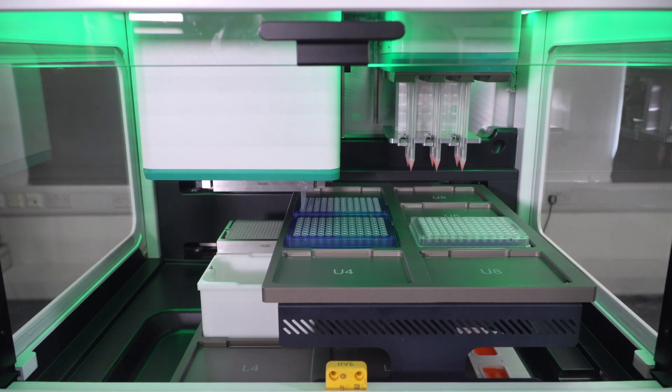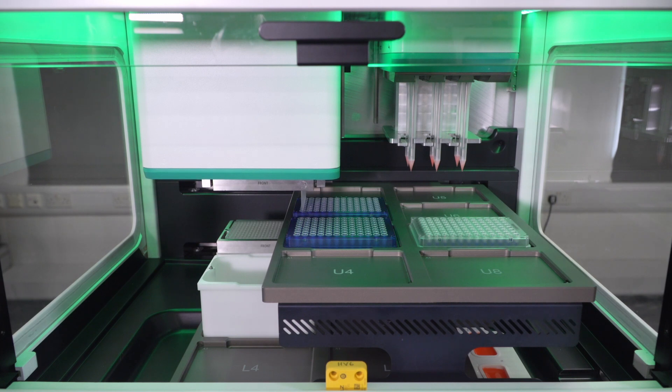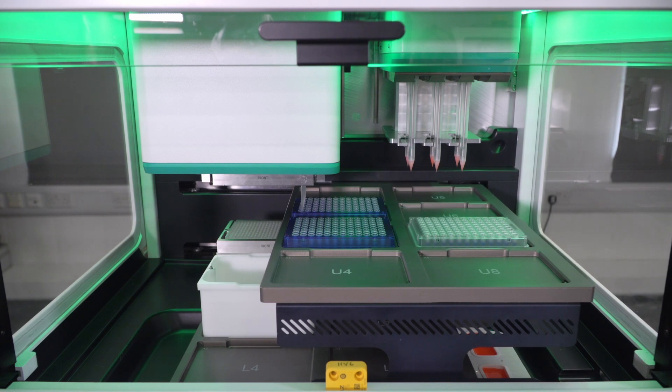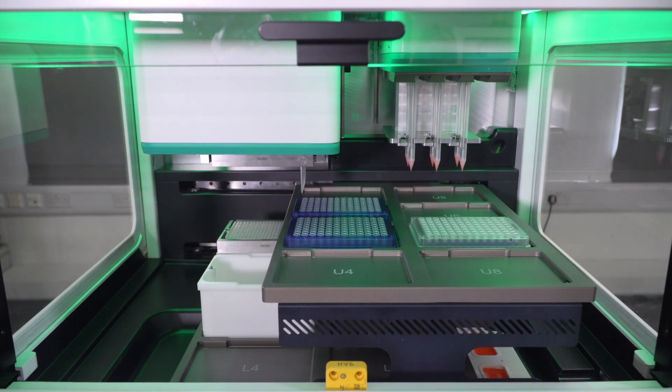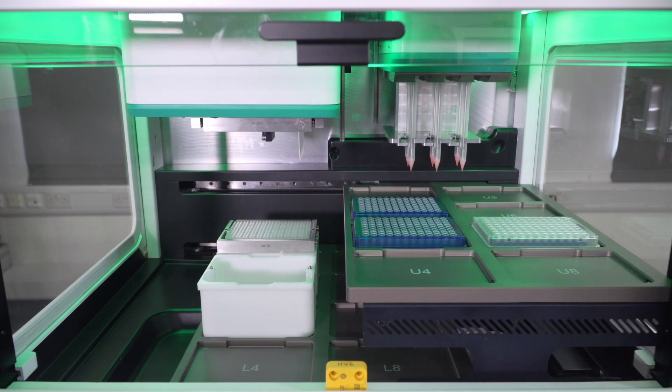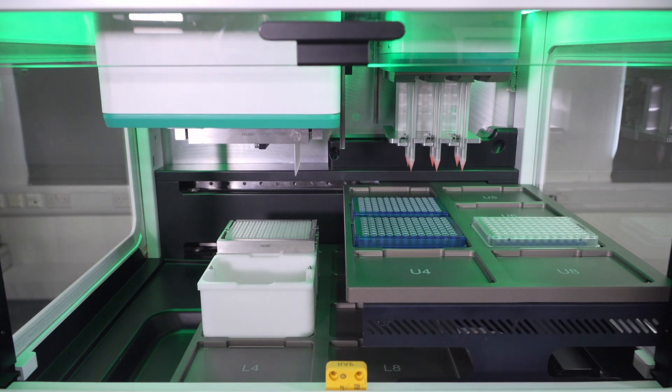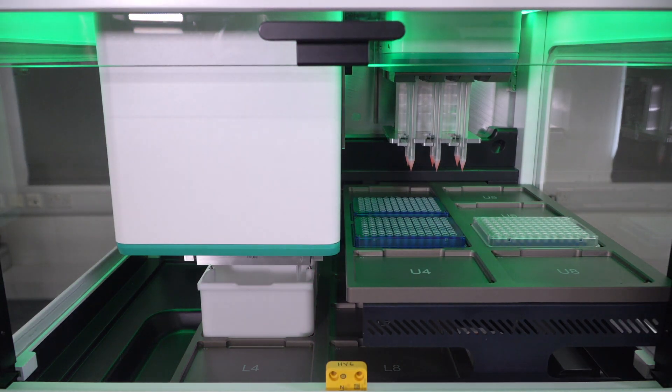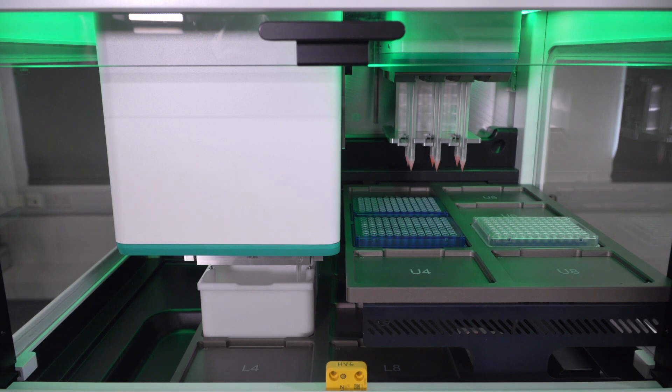Now all this liquid is dispensed into column one. It's been dispensed quite slowly to ensure that the liquid fully empties the tips. And there was a left-right tip touch. And now the final step of the protocol is unloading the cassette containing a strip of eight tips.